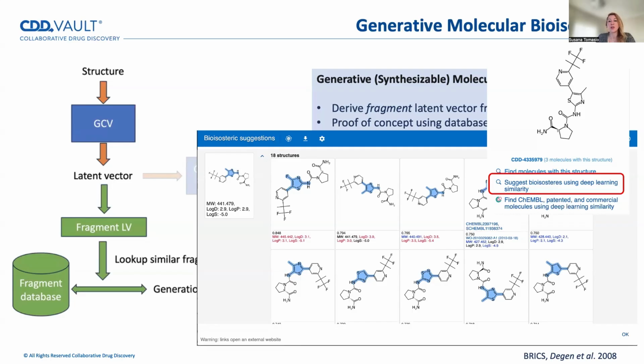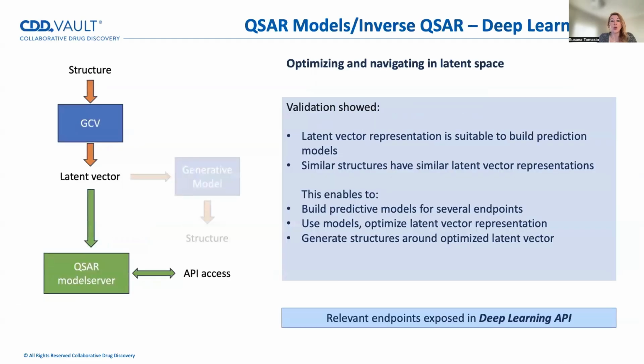frequency of its structural fragments in the ChEMBL database. It uses circular substructures such as Morgan2 or ECFP4 and counts the number of fragments that are uncommon in ChEMBL. Therefore, a higher score indicates the presence of unusual fragments, suggesting that the molecule may be difficult to synthesize. So all of these functionalities are currently available in the CDD Vault interface.